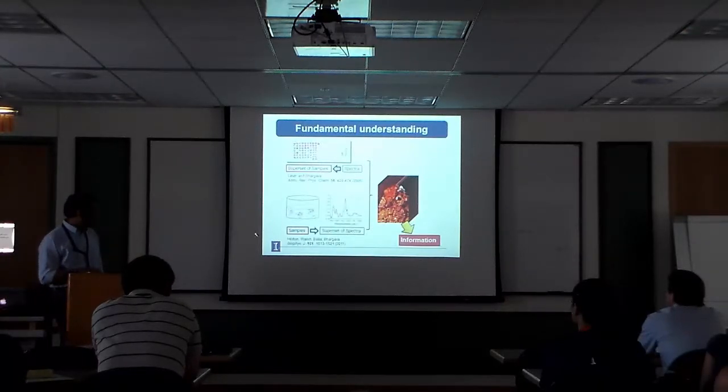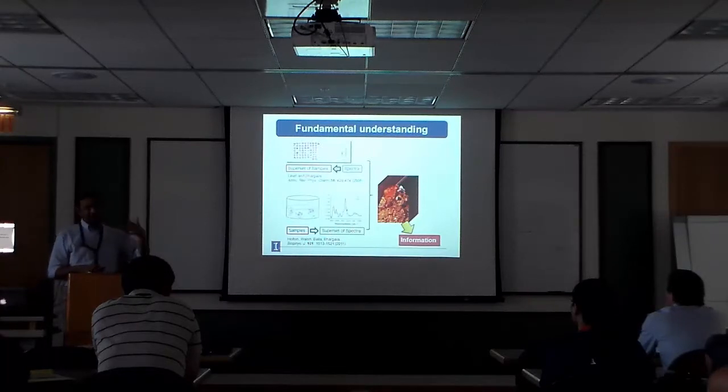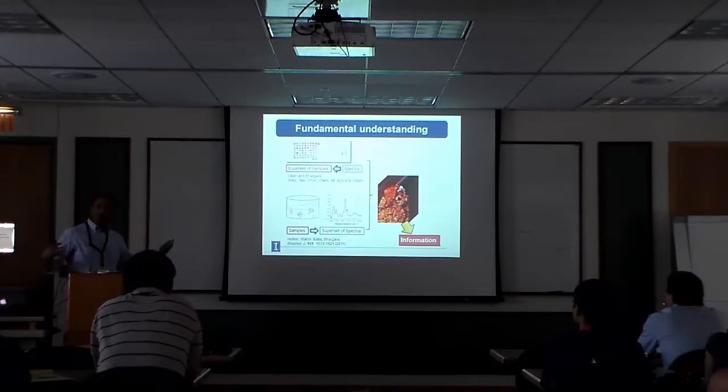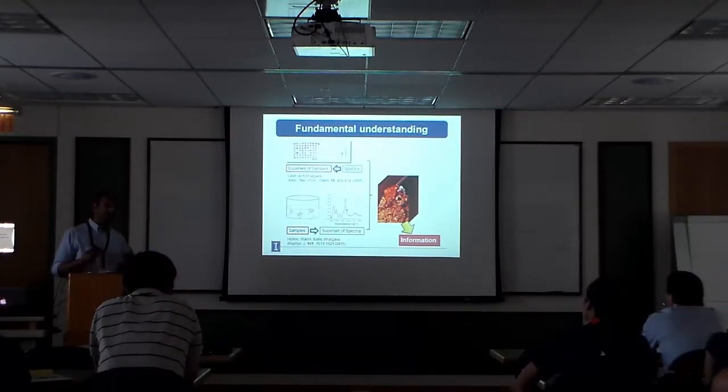And I'll show you towards the end of the talk how we've built systematically heterotypic cell culture models. So we try to build a cell culture model that mimics what's actually happening in the human body, to whatever extent we can in the lab, right? And then we use these as inputs again. So both of these things, this is sort of a top-down approach, this is a kind of bottom-up approach, and both these merge to tell us about the data that we're recording, what is the basis, what happens when something changes or not. And you really have to spend a fair bit of time in doing this.